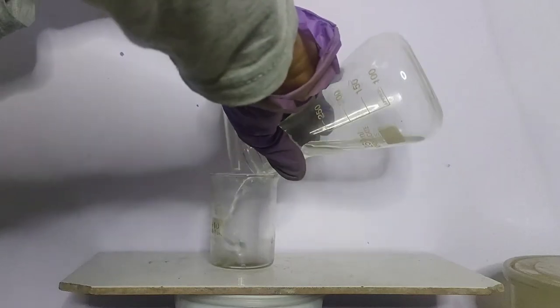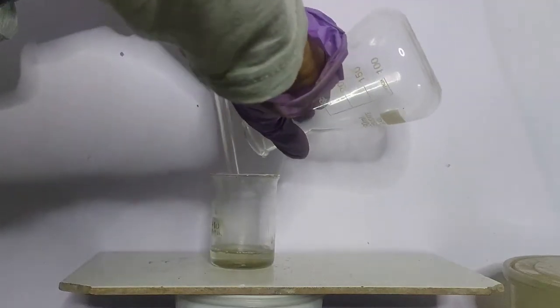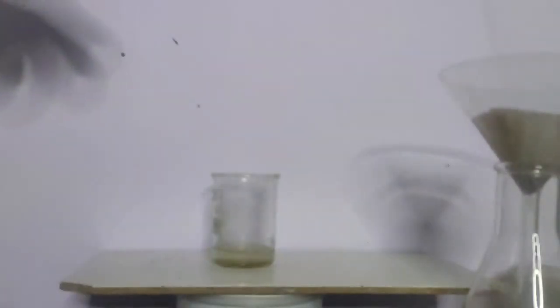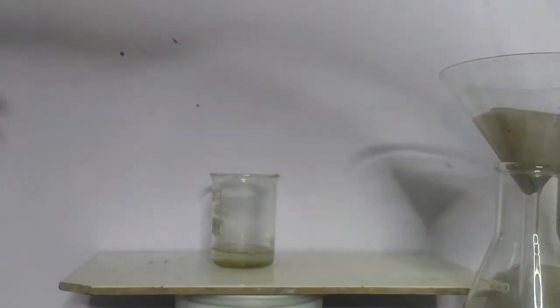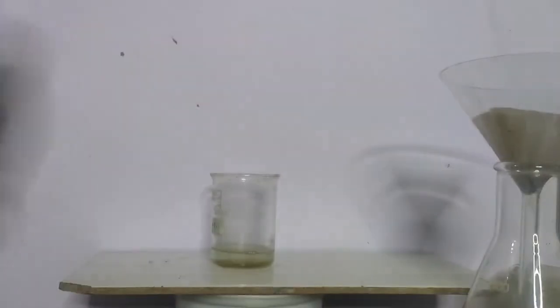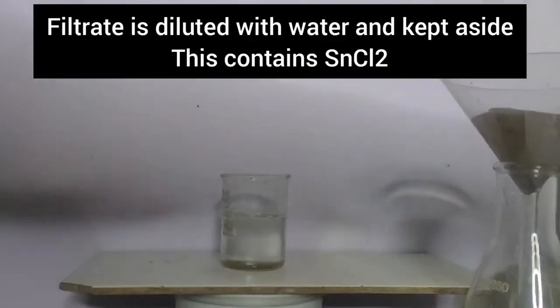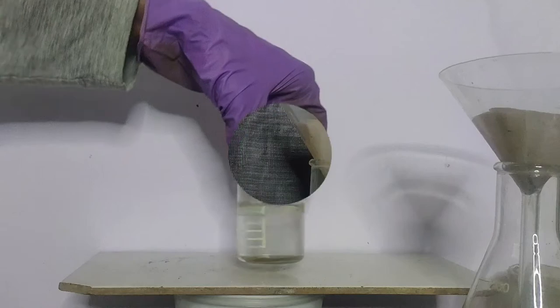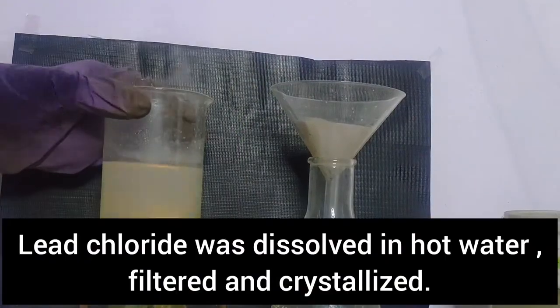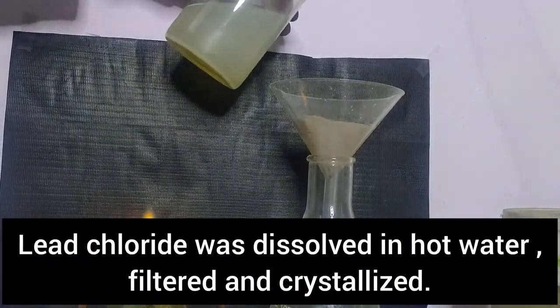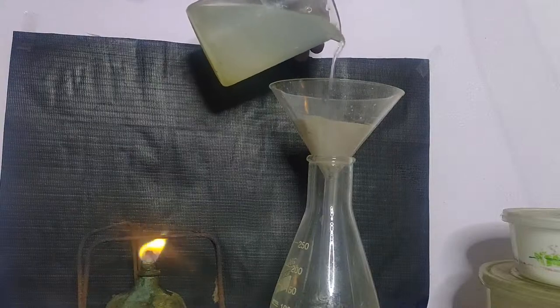Now, this filtrate contains tin chloride solution. Now this solution was diluted with some water. Now, it was kept aside and lead chloride were dissolved in hot water, filtered and recrystallized.